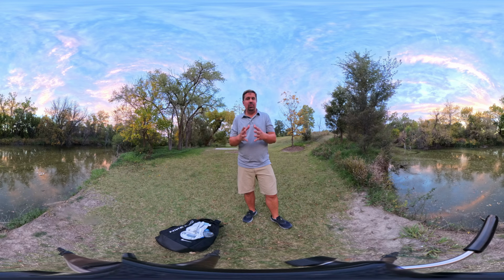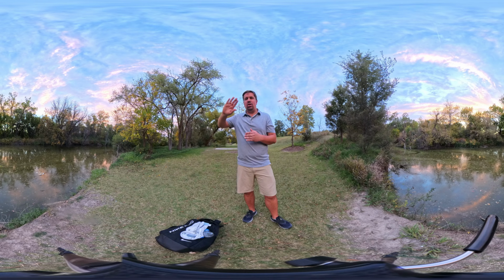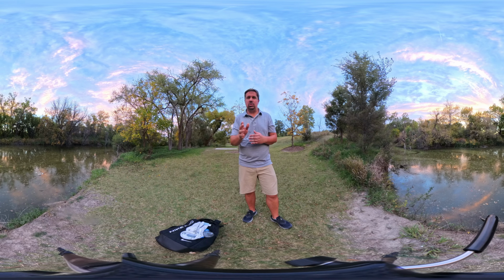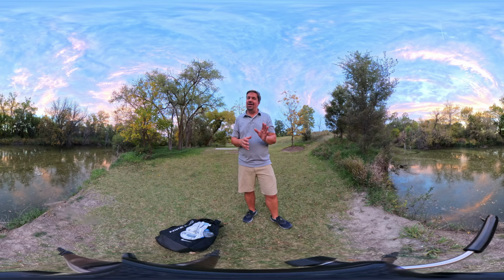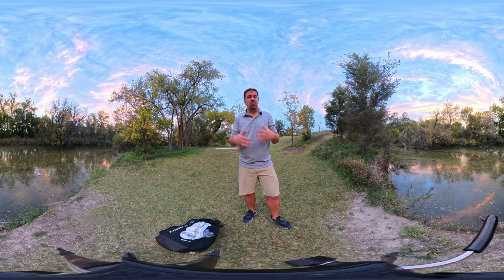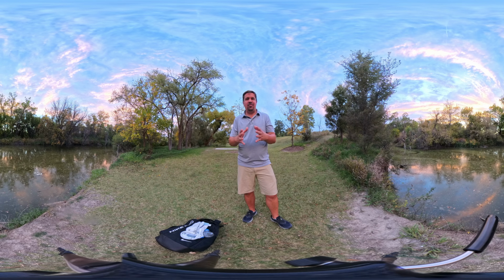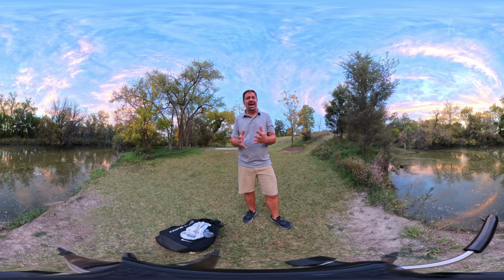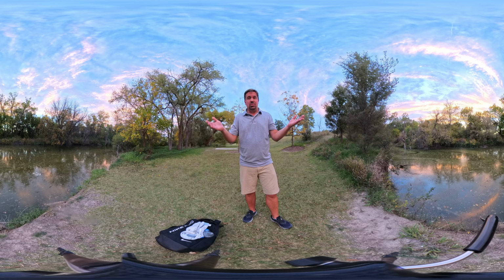And you will receive a course handout for that CURE that gives you a general overview of the laboratory steps that you're supposed to do in this course-based undergraduate research experience. Mind you, I'm no longer giving you exact instructions like in the previous experiments, because this is a research job for you. But what I do want to show you live, unedited, in its full glory, is how we actually collect these cyanobacteria from a presumed cyanobacterial bloom.